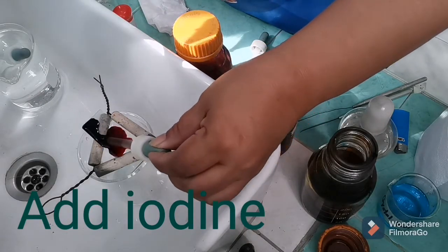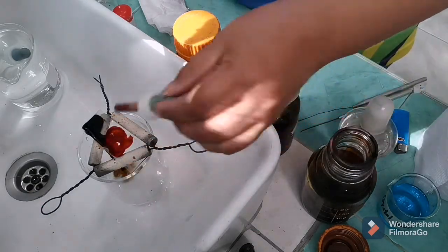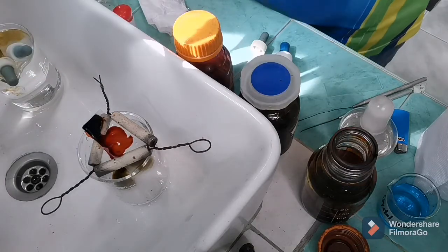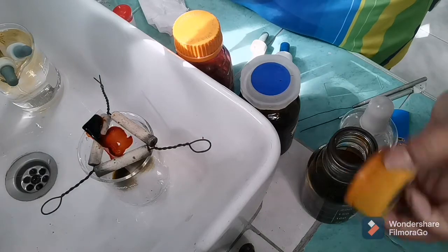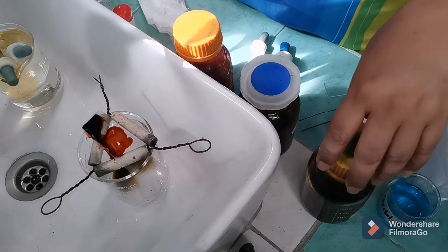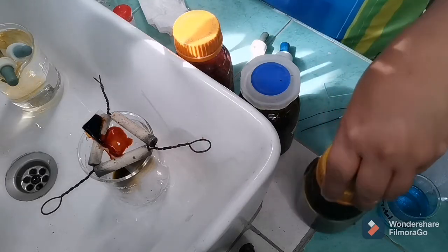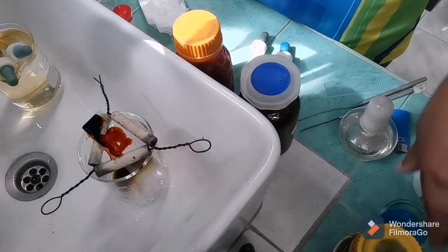So, there you are. We are going to wait for another 1 minute. The gram iodine solution will be there for 60 seconds or 1 minute.